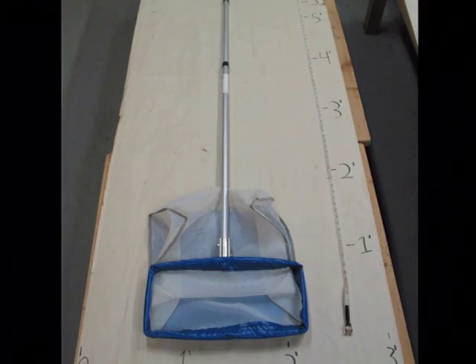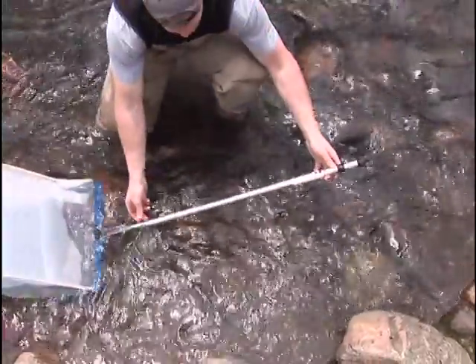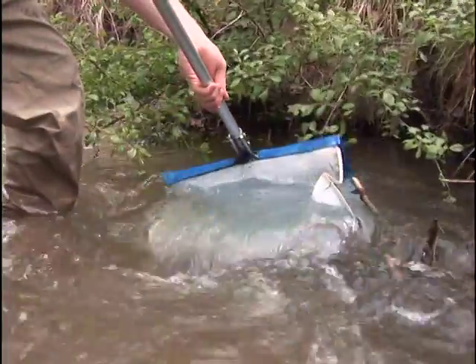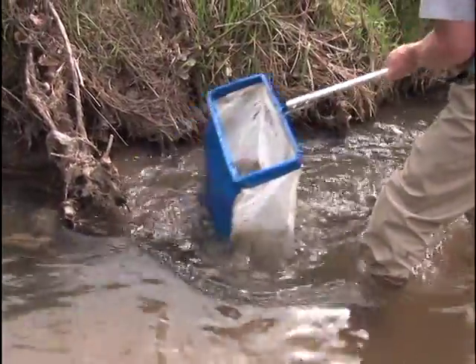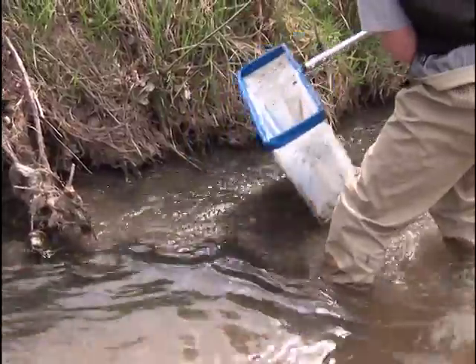Measure your net prior to sampling and mark a length of 5 foot 5 inches on your net handle to remind you of the proper length. By laying the net down and making a mental map of this sample area, inside this rectangle will be the area you will kick. Here you want to prod and disturb the debris as much as you can. Remember, work from downstream to upstream to allow the water current to carry any insects you dislodge into the net.